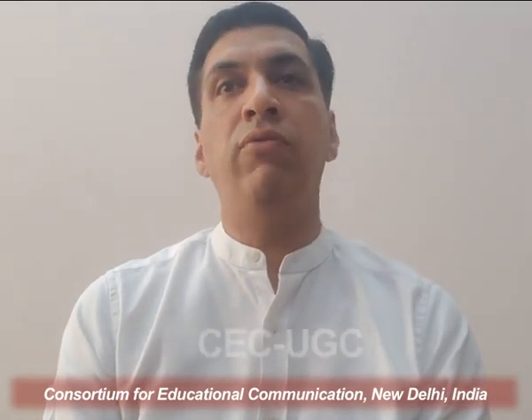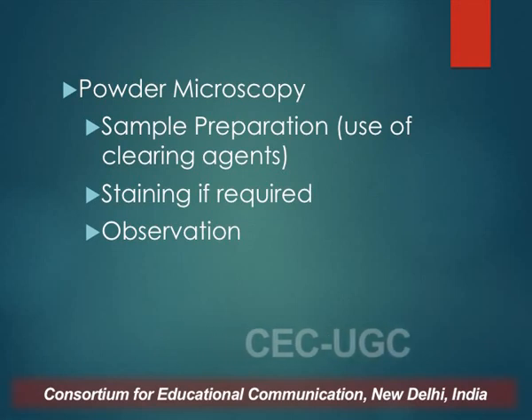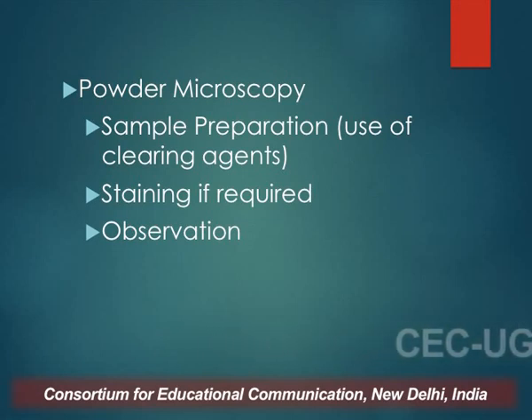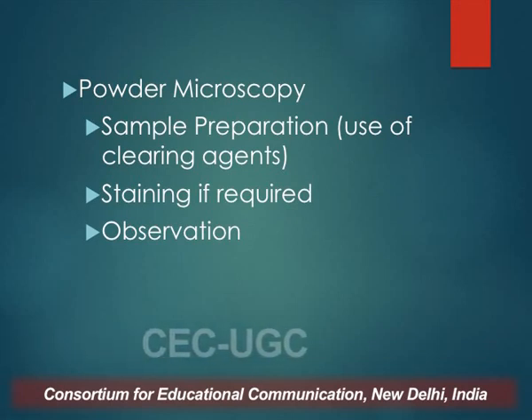present in the powder. And simultaneously, since some of the powders may have large amount of the coloring matter, say for example if we are getting a powder of a leafy plant material, or in case of some barks, they may have certain coloring agents. So second step is to decolorize that powder.